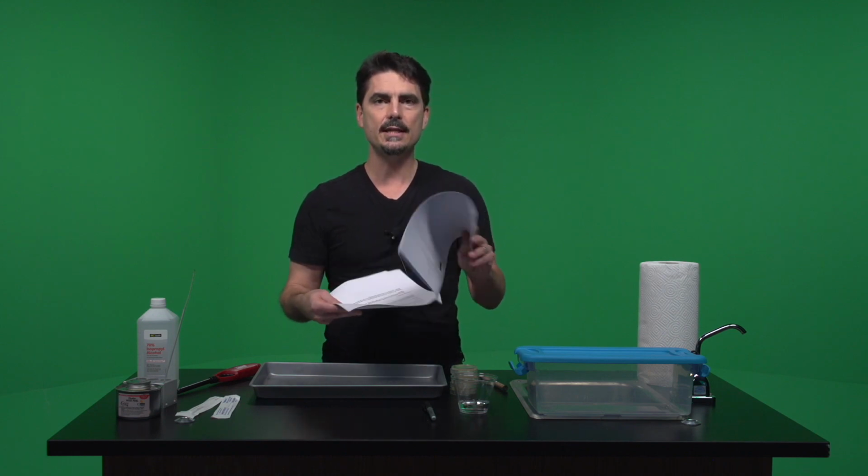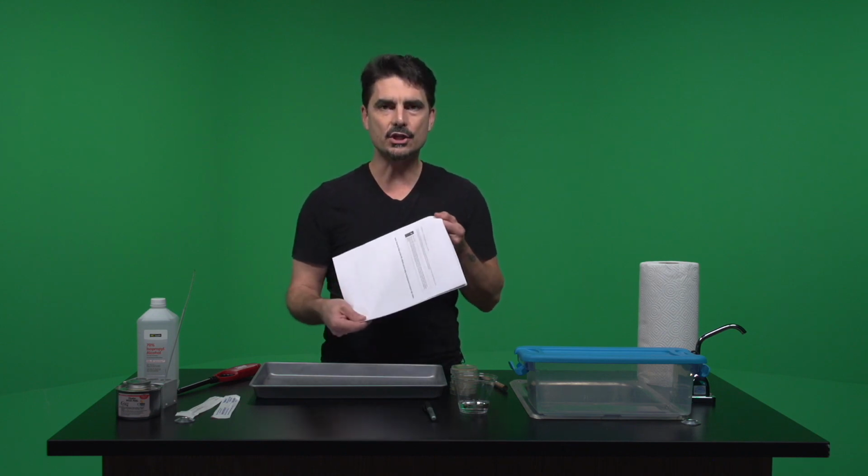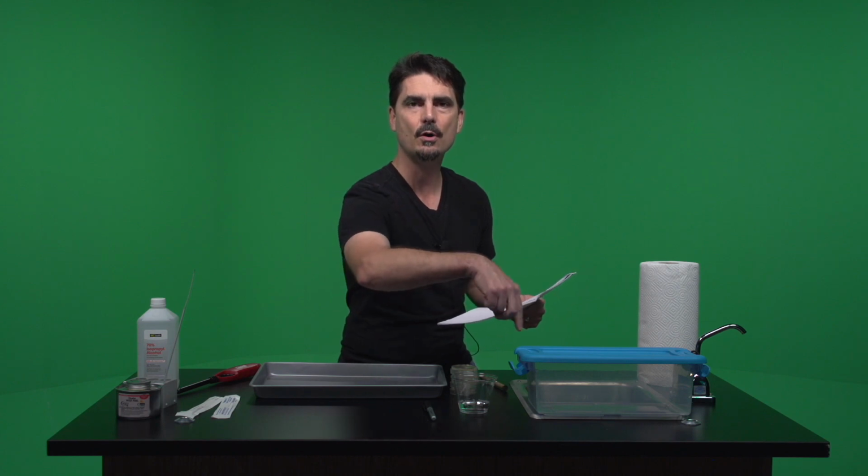The other thing is, please print out the directions and follow the directions from the printed form, okay? Not with a laptop, not looking at a computer, because when you're working with microbes, the last thing you want to do is go over to your computer and use a mouse or scroll up or down, because then you have a chance of contaminating your computer. In the microbiology lab, for the most part, you're never pulling out your phone. What you work with in the lab stays in the lab, okay?